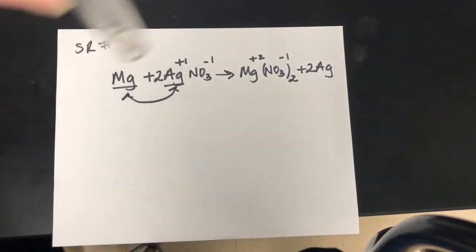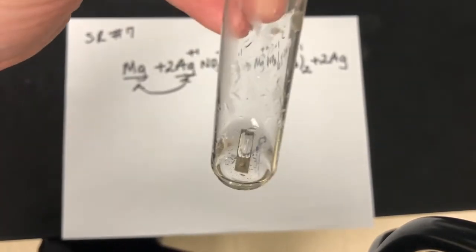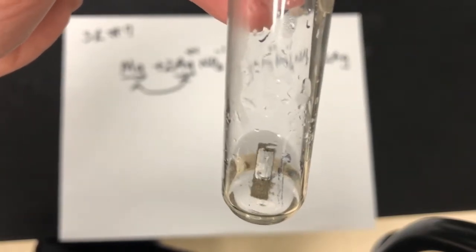Okay. So we'll zoom in just a little bit, as we can tell that something is happening. The silver is being plated out onto the magnesium.